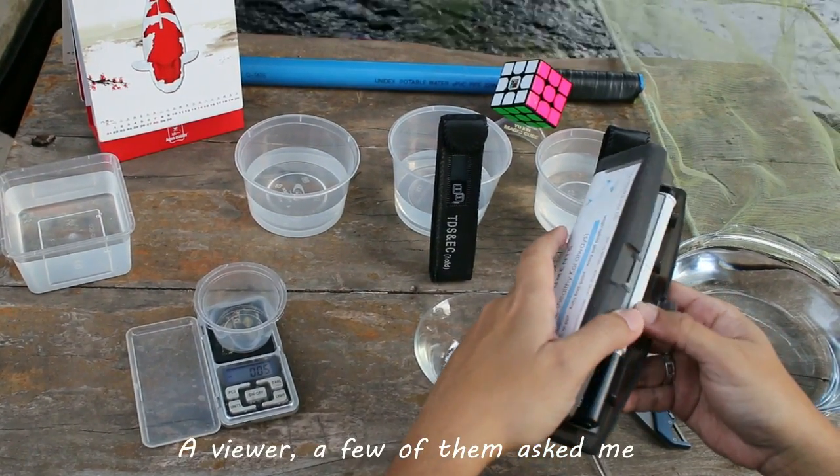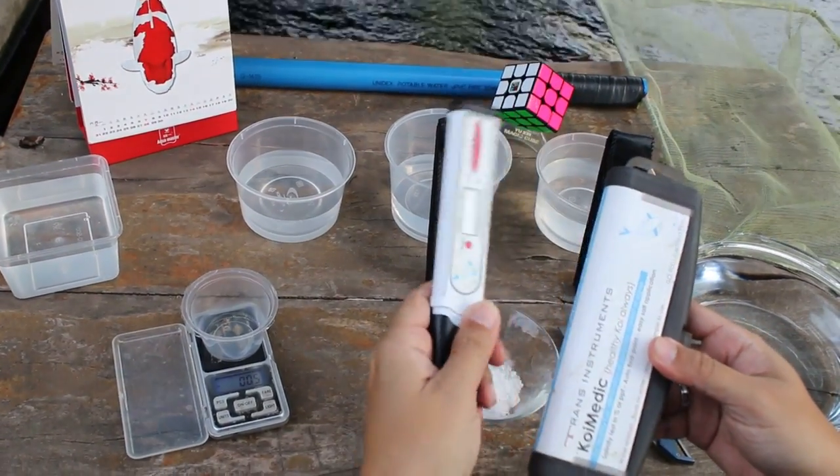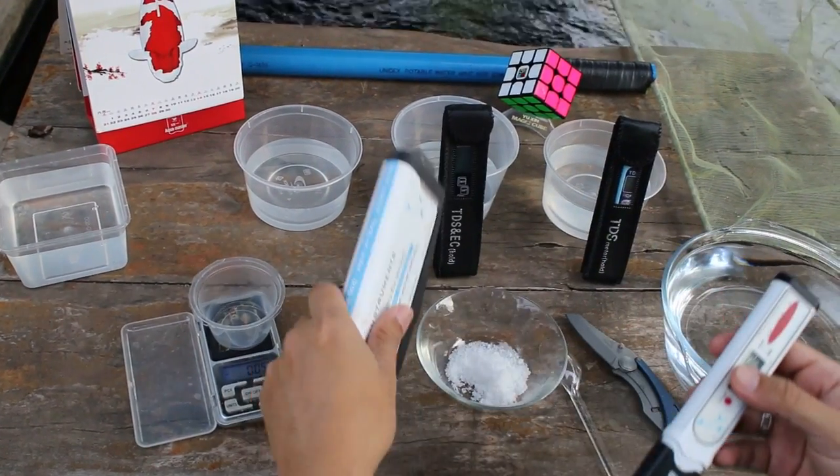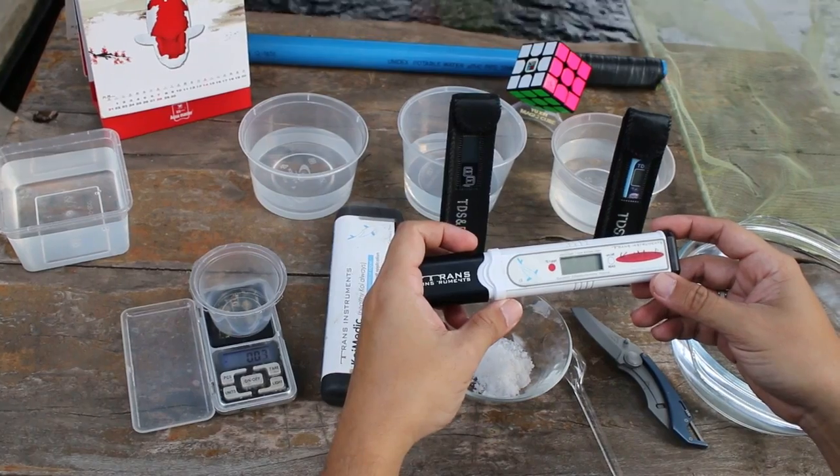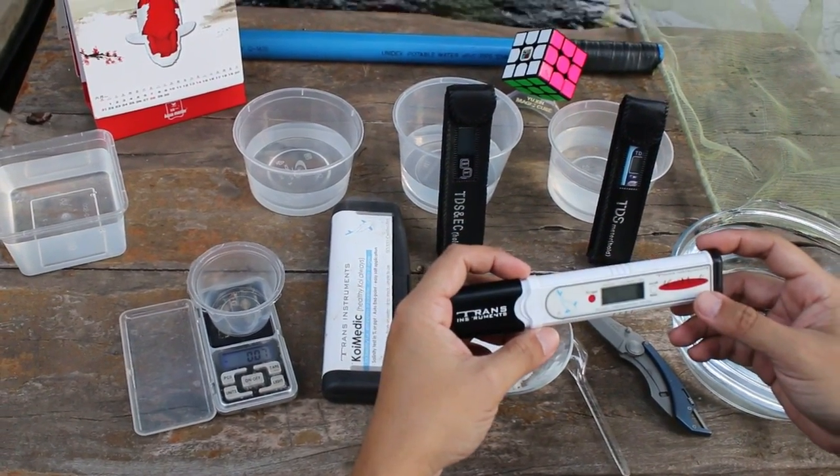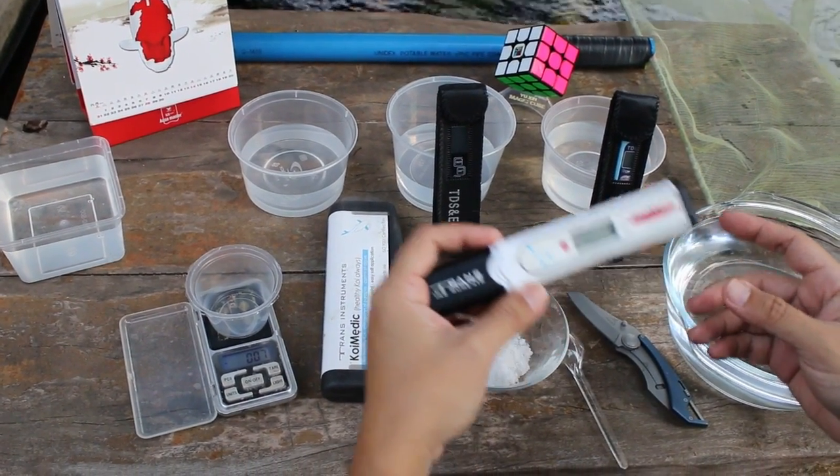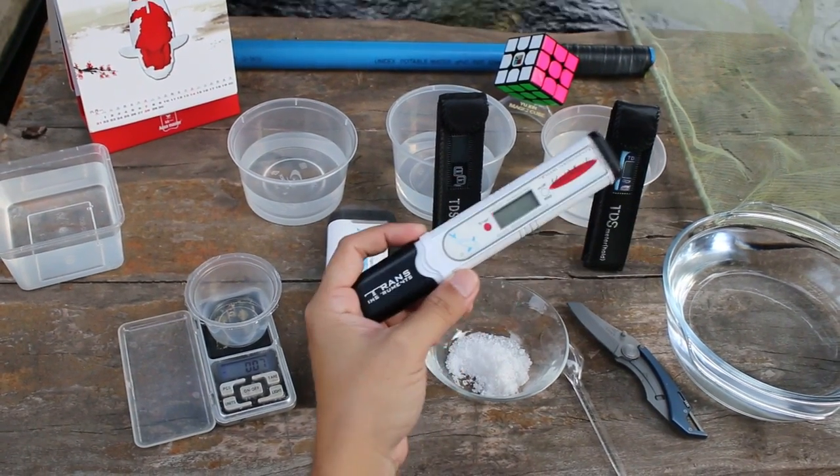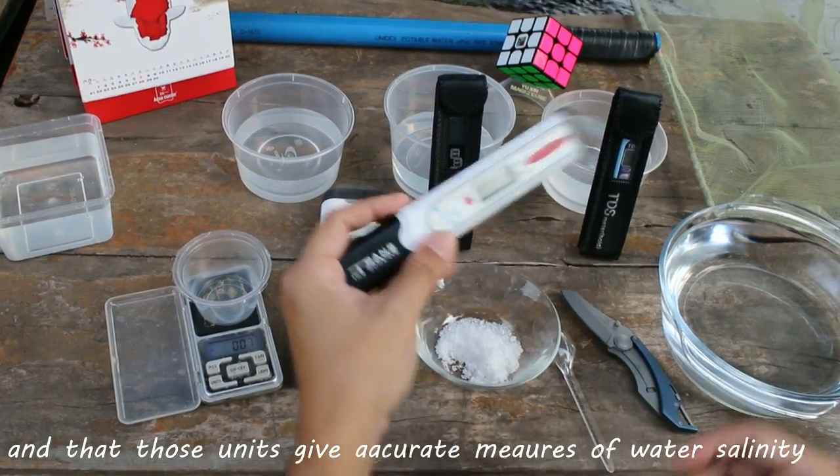A viewer, a few of them, asked me where did I buy my salt meter and I told them I bought it from a seller online. After I mentioned my salt meter, the next question that popped out was: are the cheap salt meters that are sold online capable of doing what these much more expensive ones can do? You want to make sure before buying it that those units are safe to use and that those units give accurate measures of water salinity.